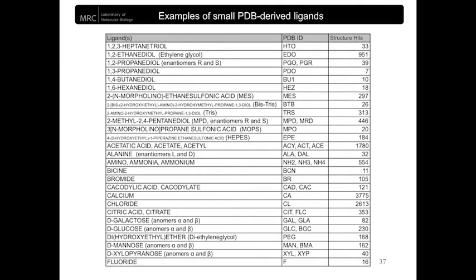Small molecules and ions found abundantly in the PDB are potentially good crystallization agents. Surely, as additives, they can make proteins behave differently. For Morpheus 1, PDB-derived ligands that are not larger than 250 daltons, well-soluble, stable, and readily available were selected. While small and soluble, the chances of unfavorable interactions that would prevent them from binding efficiently or destabilize the protein should be minimized.